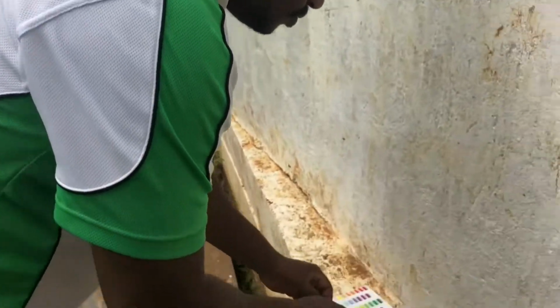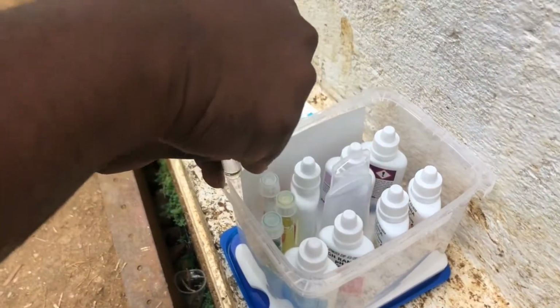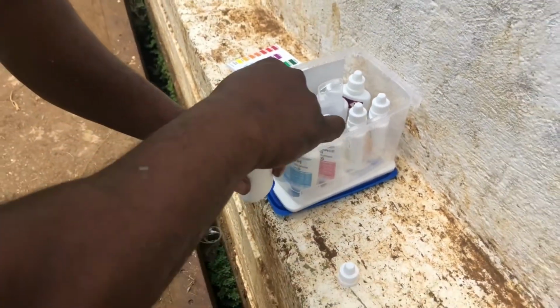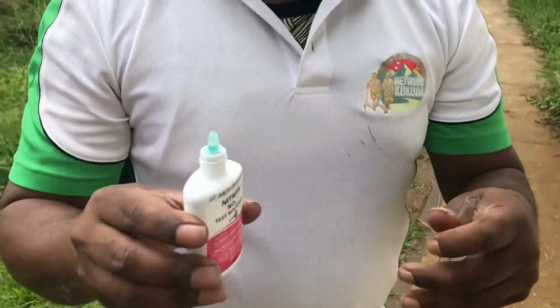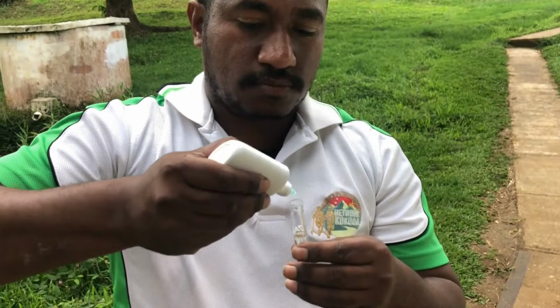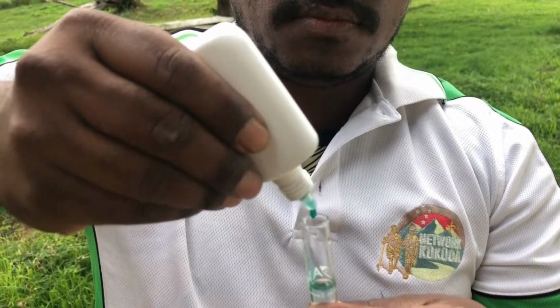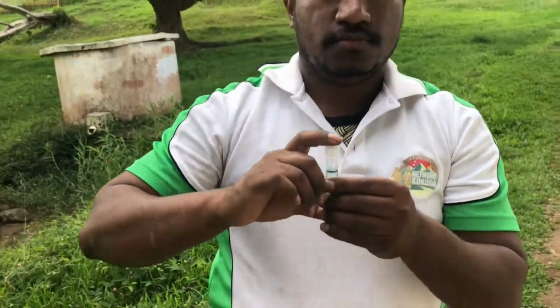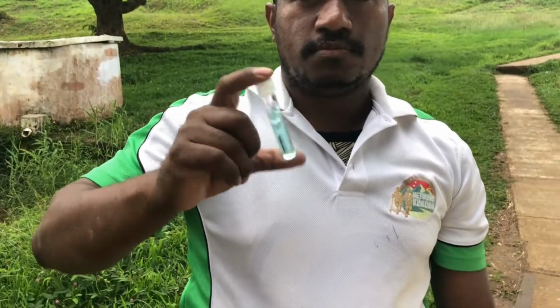Test 3, nitrite. In a healthy system, ammonia is broken down into nitrite, but this is also toxic for fish. Add 5 drops of nitrite test solution. Put the cap back on and shake fast for 5 seconds. And this one we also have to wait 5 minutes.